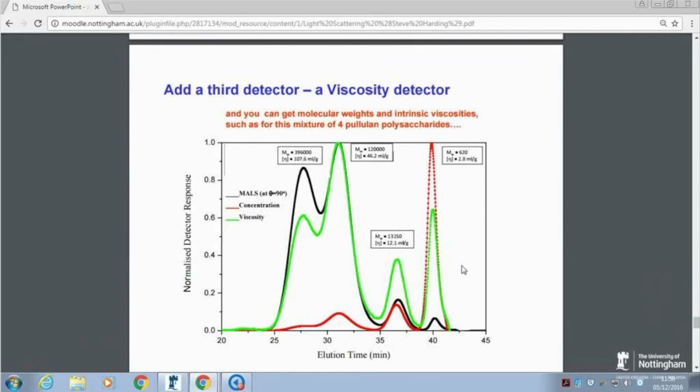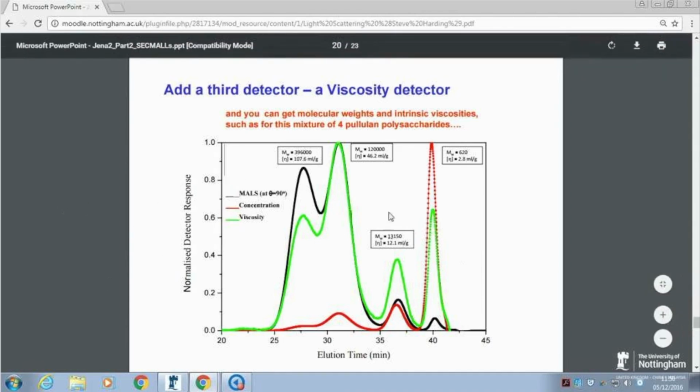And from how the viscosity changes with molecular weight, we can get the conformation by, what was that equation which linked the intrinsic viscosity with molecular weight? MHKS, that's right, the Mark-Houwink-Kuhn-Sakurada equation. Remember the Haug triangle? Yeah, good. So this is a nice piece of kit when it works. This is a nice piece of kit.